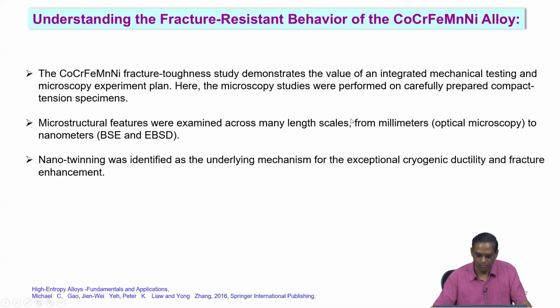Again, we have combined all these techniques, BSE and EBSD here, to identify this orientation, especially wherever a deformation related study is required. It is wiser to use EBSD, because it gives an orientation. You can identify the kind of slip direction, twin plane. We will be able to correlate with that.